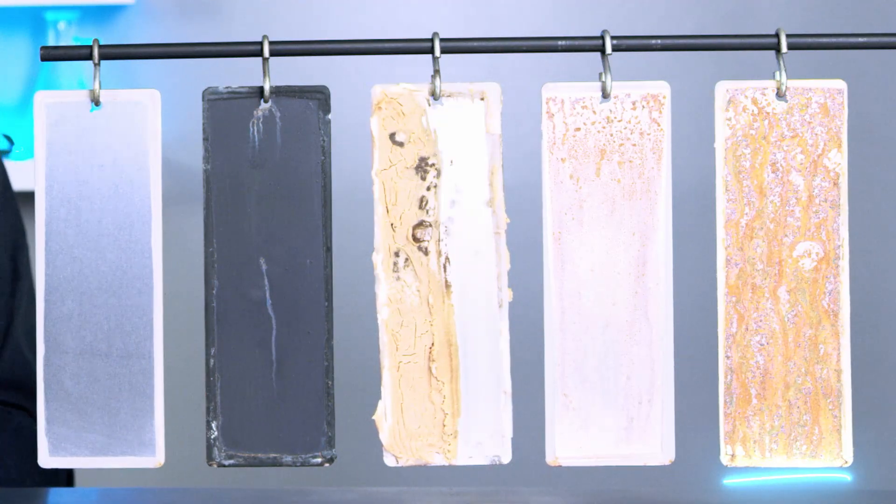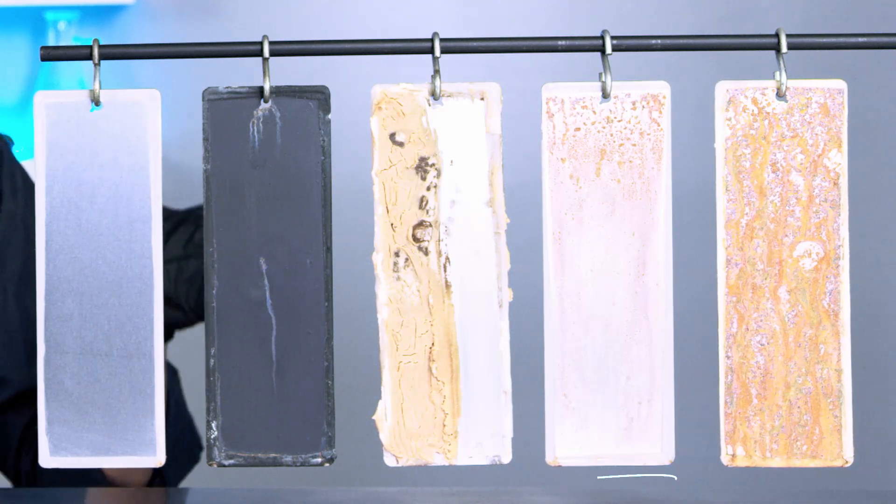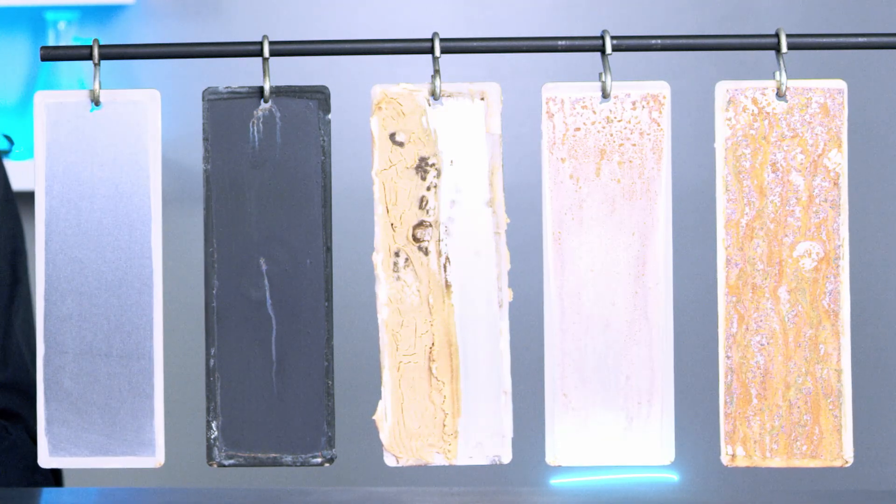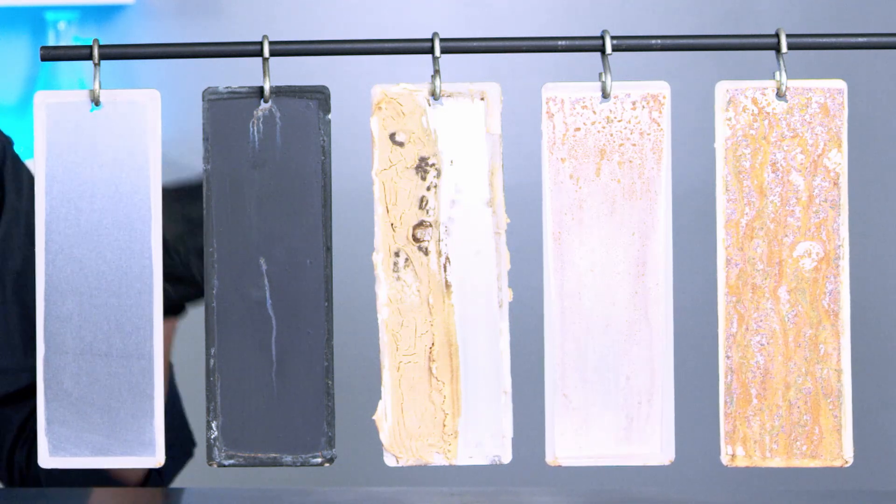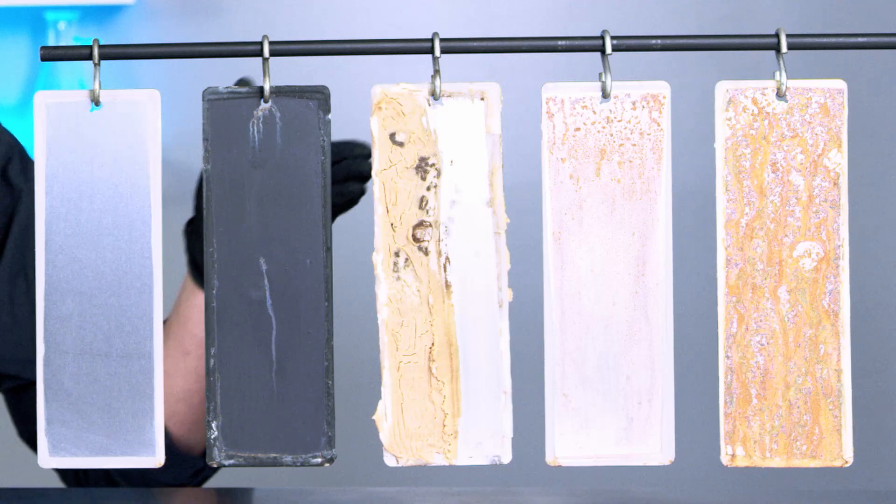The first panel had no protection applied to it and as you can see it's very corroded. The second panel we applied a thin oil-based rust protection product, and although it's provided some protection, after 72 hours in that salt spray cabinet chamber it's still quite corroded.